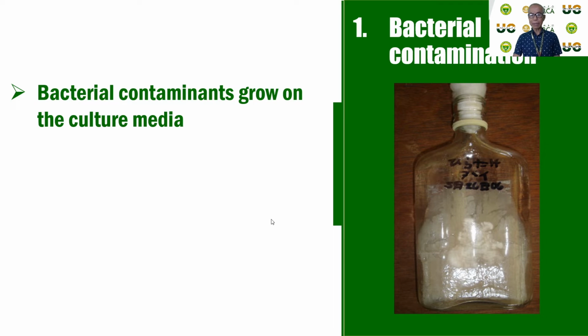Bacterial contamination. Bacterial contaminants grow on the culture media, usually a day after inoculation. Bacterial growth can be characterized as slimy and water-soaked, especially if the slanted medium has excess water. There are two sources of bacterial contamination.